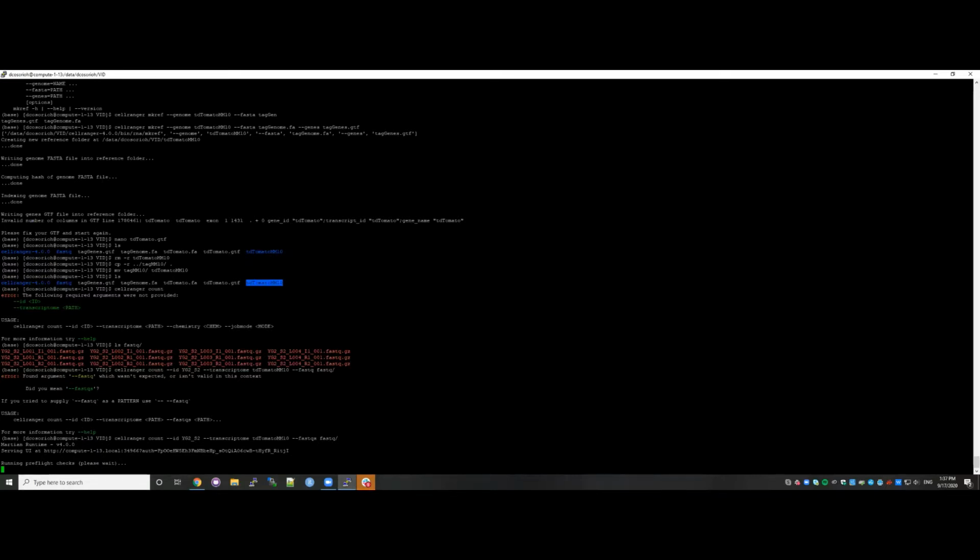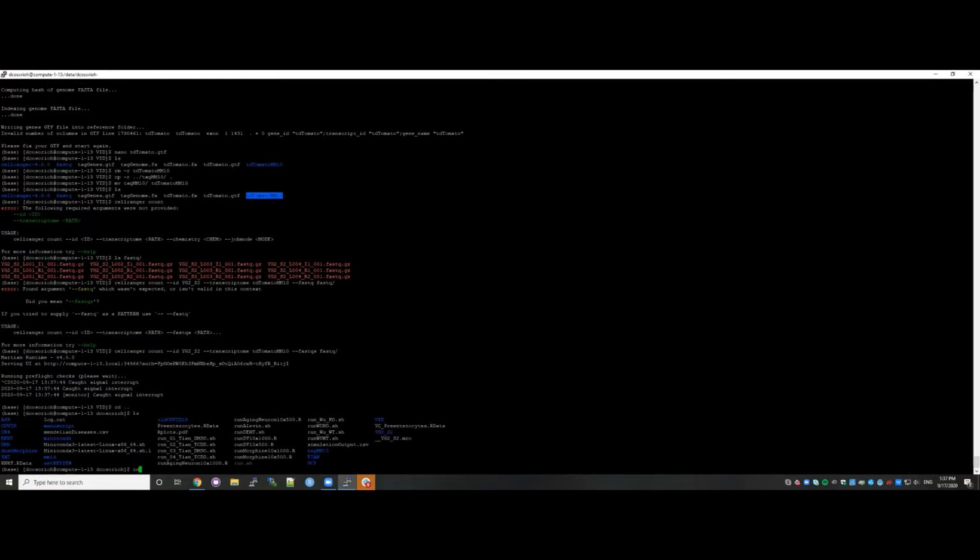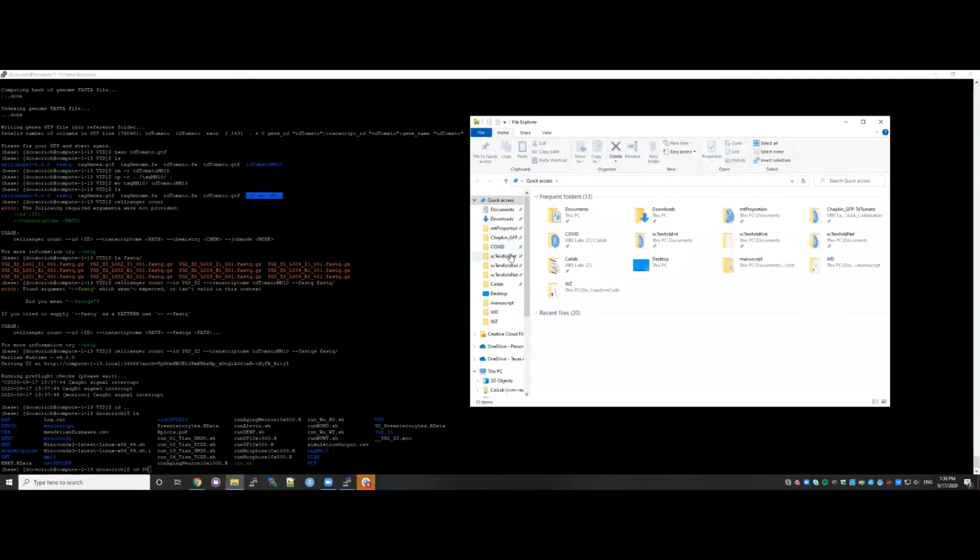And the output will be a cell expression matrix, like genes by cells? Let me stop here, and then it will run for 4 or 6 hours, and at the end it will return you something like this. Like a BAM file? Yes, it will give you a BAM file, but okay, I have some examples in Windows.